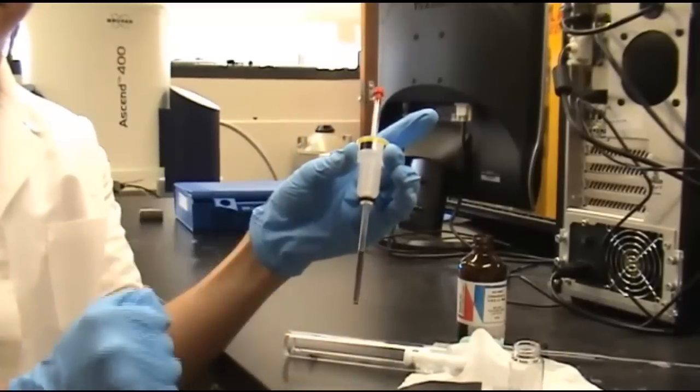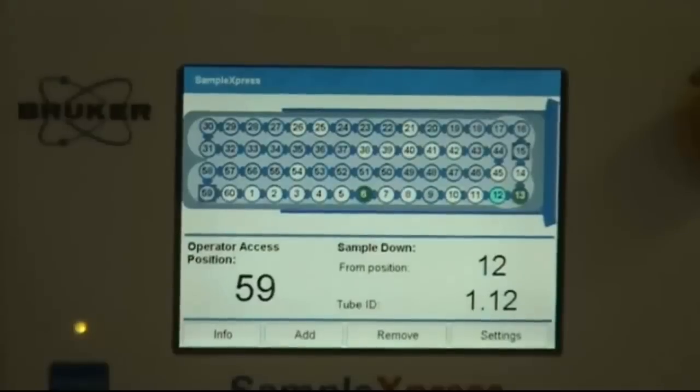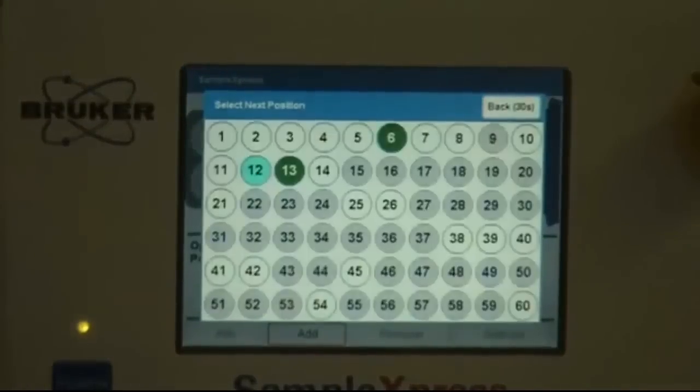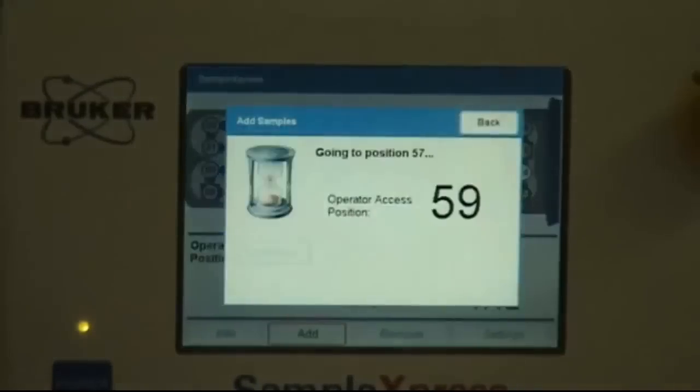Next let's go over to the NMR. To add your sample, click add, go to position, and then the corresponding number.